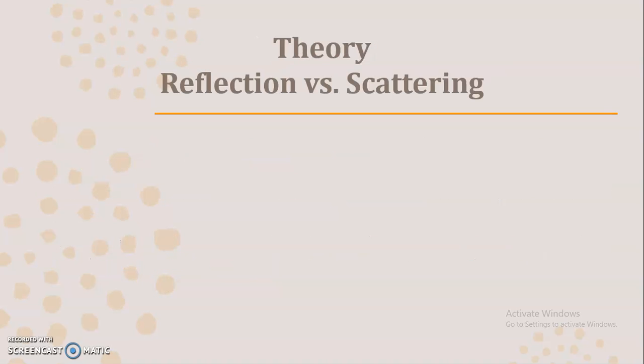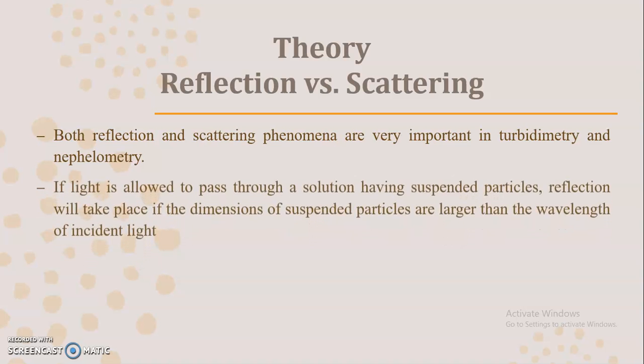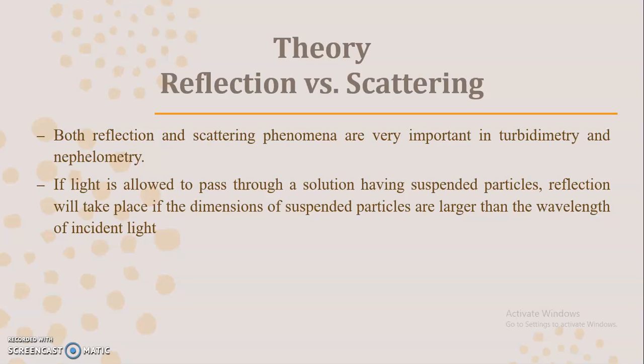Now after this we will see what is the actual theory involved in nephelometry as well as turbidimetry, that is reflection versus scattering. Both reflection and scattering phenomena are very important in turbidimetry as well as nephelometry. If light is allowed to pass through a solution which has suspended particles, then reflection will take place if the dimension of suspended particles is larger than the wavelength of the incident light.